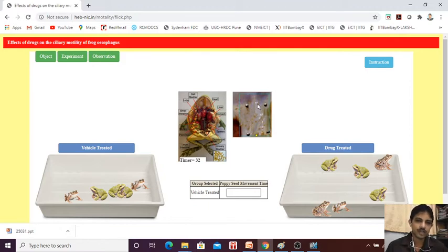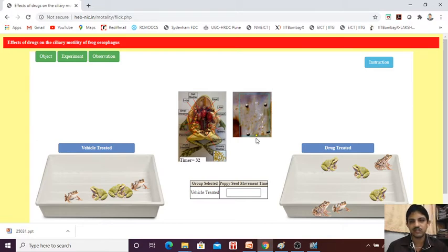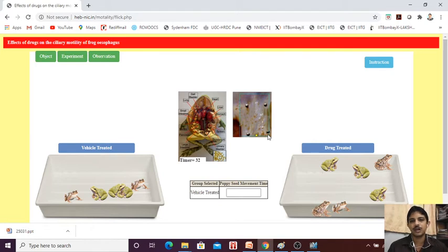Now, whenever we are exposing the cilia from the buccal cavity, we are going to see that here we are going to pin. We will pin into the front and we are going to pin into the last.